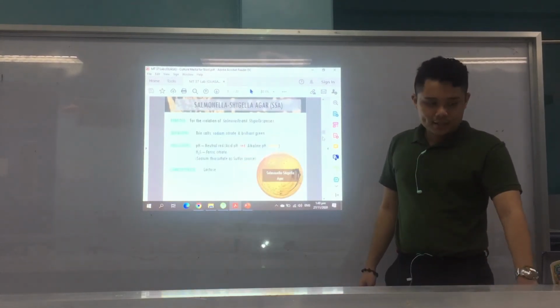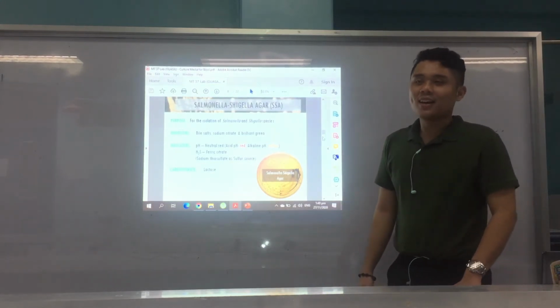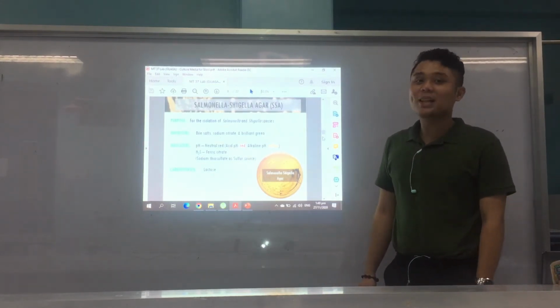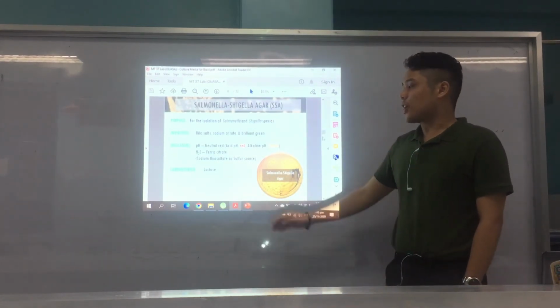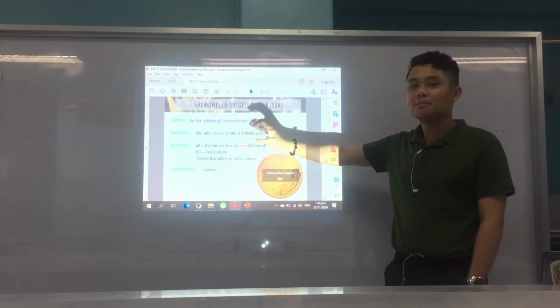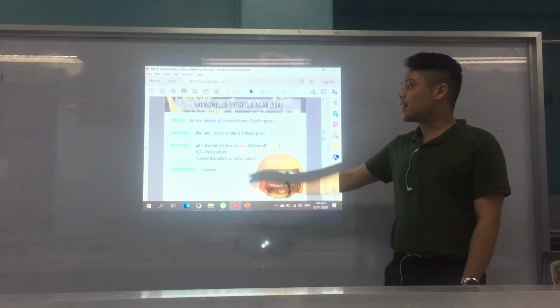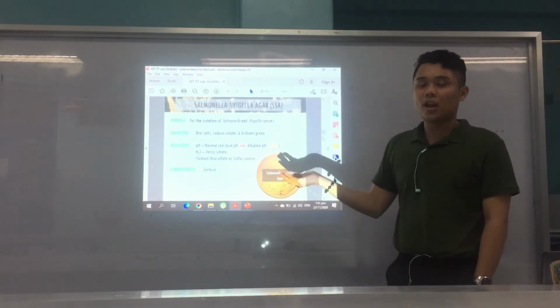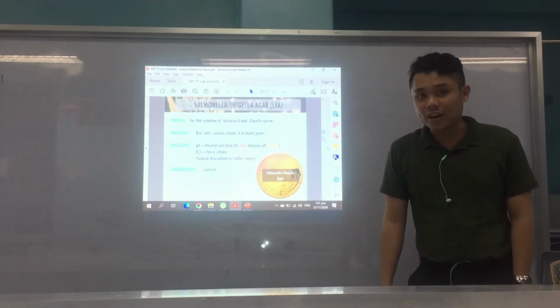Okay, the next culture medium is also your Salmonella Shigella agar. It's in the name, SSA, Salmonella Shigella, for the isolation of Shigella and Salmonella species. So, your inhibitors: bile salts, sodium citrate, and brilliant green. Same as BSA, with the addition of sodium citrate. Alright, the pH indicator is neutral red, same as your MacConkey agar. For H2S, ferric citrate, okay?